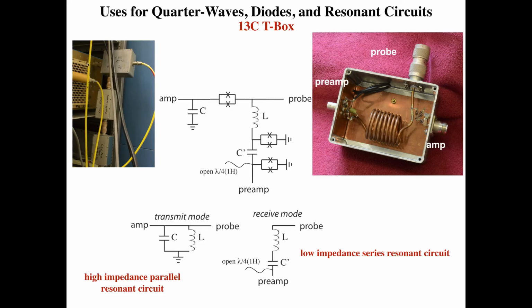Again, here's our carbon amplifier, and this is the box we're interested in. It looks like a T because there's a connector there and a connector there and a connector there. These are some low-pass filters that we made, but we're really interested in this box here. This cable here is going off to the preamp again. So let's open this box up and see what's in there.